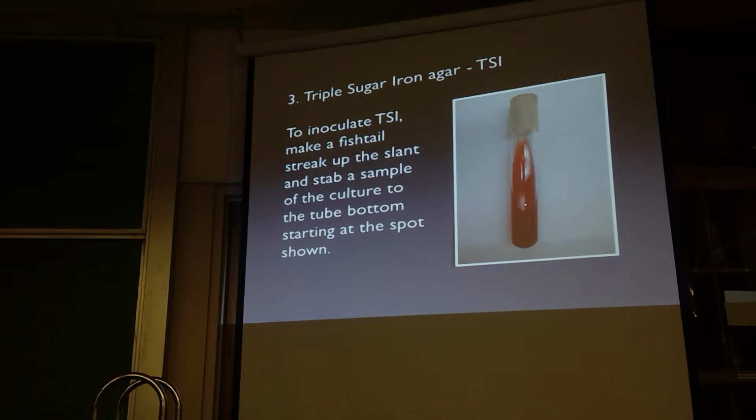And the 3rd thing you're going to inoculate is triple sugar iron agar. This is abbreviated TSI. And although students often refer to the SIM test, they very rarely refer to the TSI test. Neither one of them are to be read as words. They're acronyms. SIM, 3-part test. TSI, multi-part test. TSI stands for triple sugar iron. So there's 3 sugars in here. The sugars are glucose, sucrose, and lactose. The iron in the medium is testing for hydrogen sulfide production.